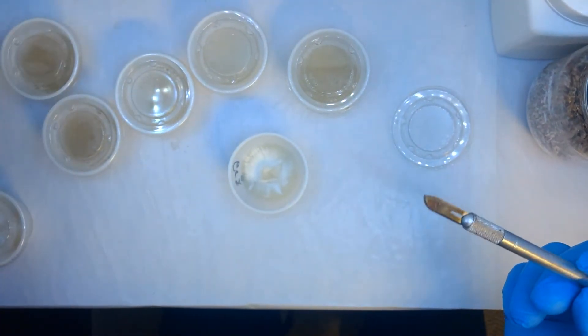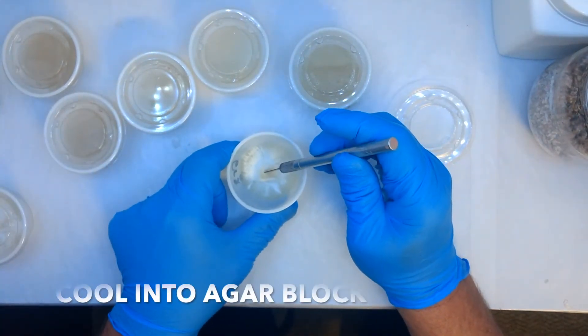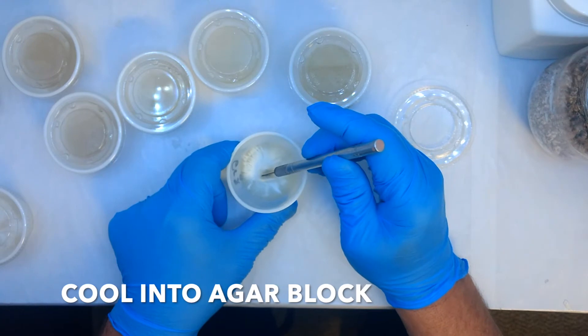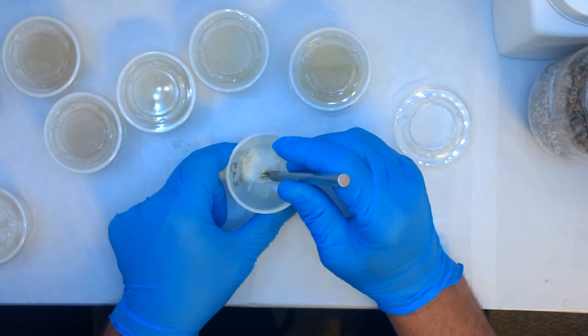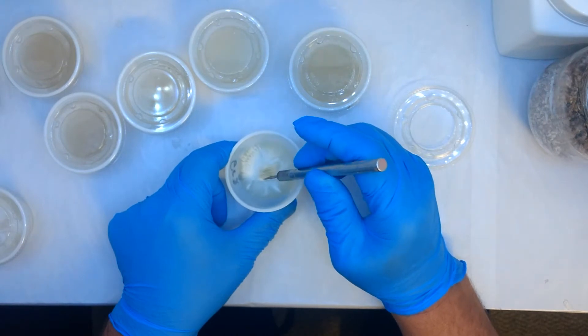What you want to do now is cool down the scalpel into the agar. I usually shove it into the top of the other agar. I can just hear the mycelium screaming. And then select where you're going to be cutting the agar out of.